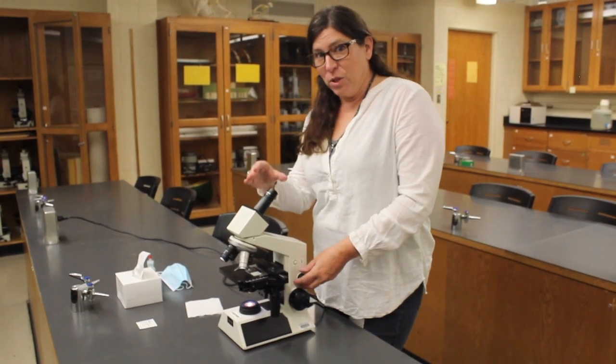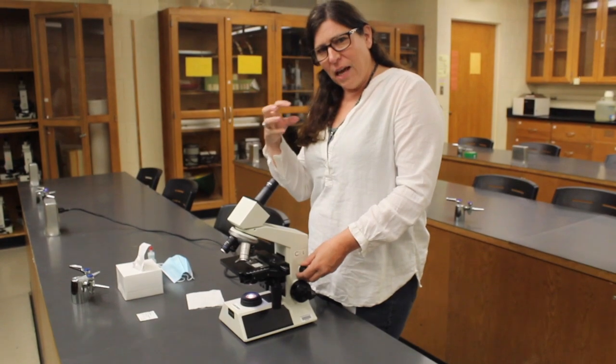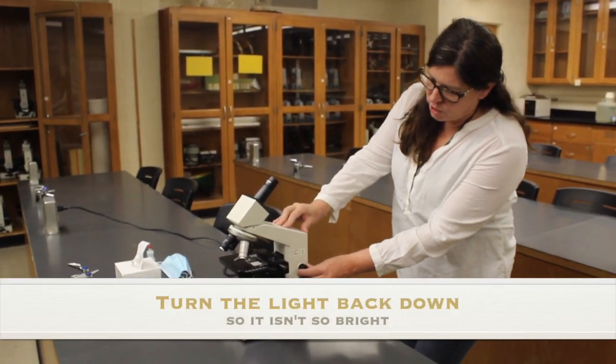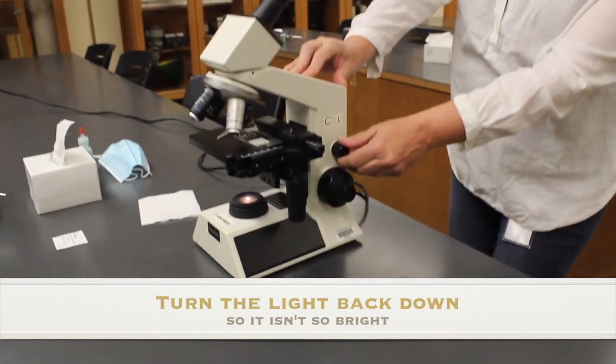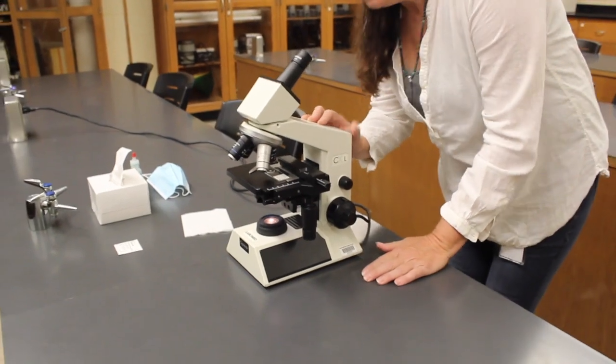This is the first time I'm going to look into the microscope. But I don't want to burn my retinas. Remember, I turned that light up really bright so we could center it. I'm going to turn that light down now by turning my rheostat down till it's about halfway dim. And now I'm going to look in.